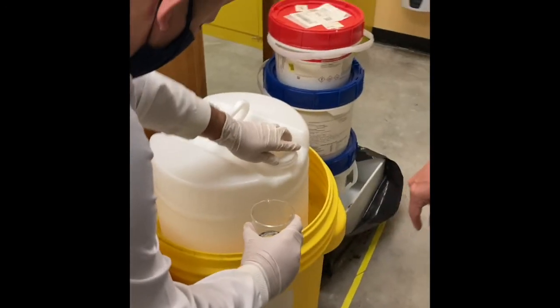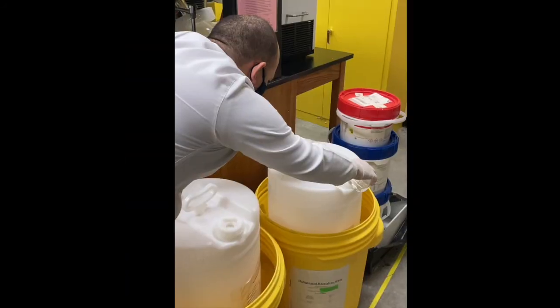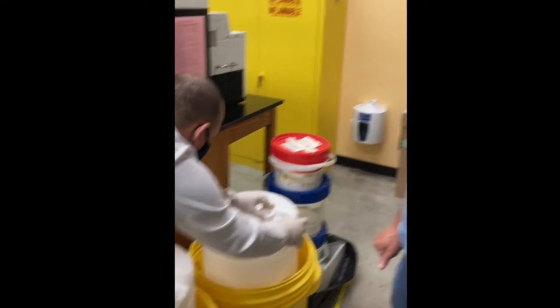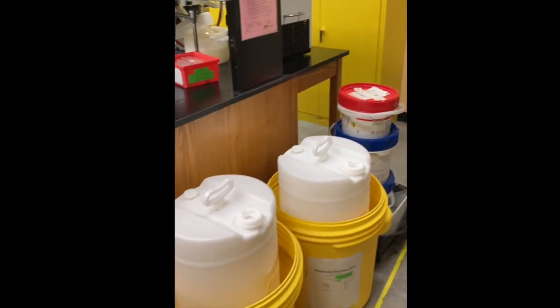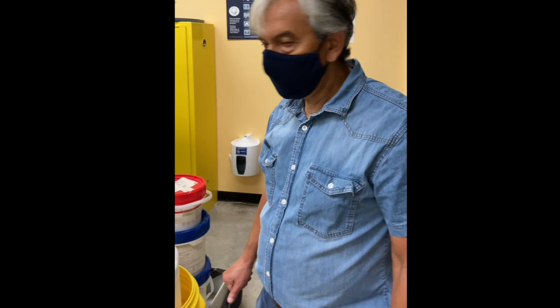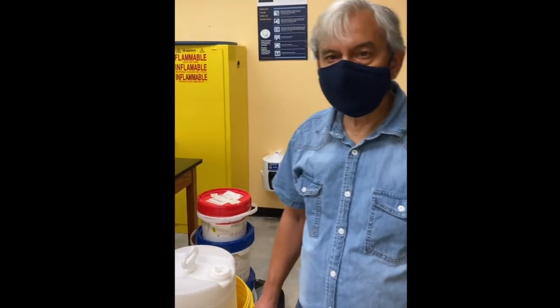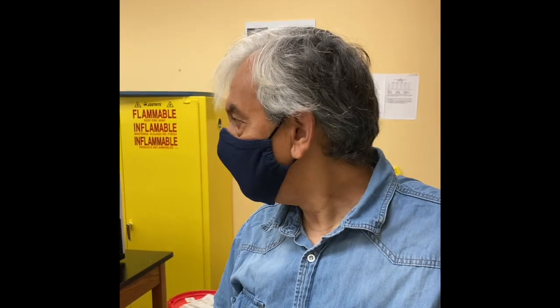The solution of acetone goes to non-halogenated waste, but all other solutions you made have either HCl in them or brominated acetone, and therefore they go to halogenated waste. So to finish the lab, wash all the glassware, put it into its correct place on the shelves, and this is it.